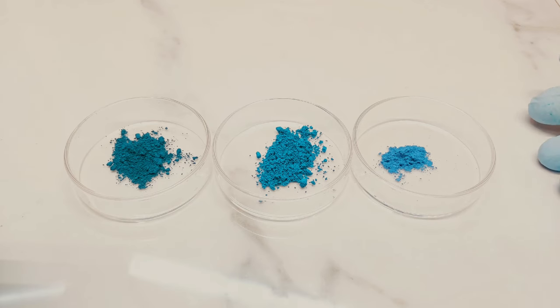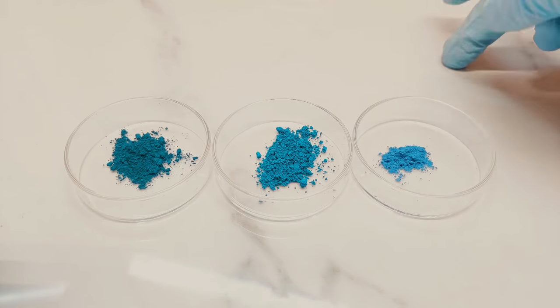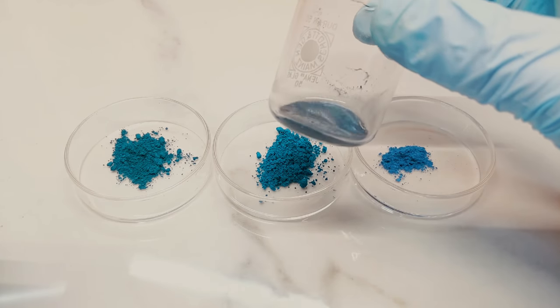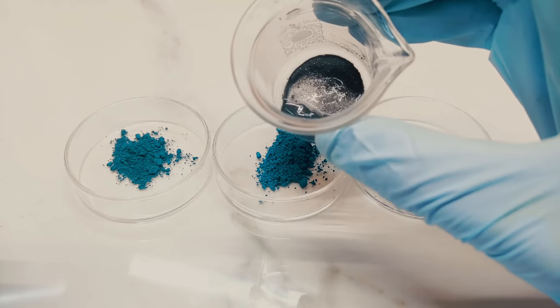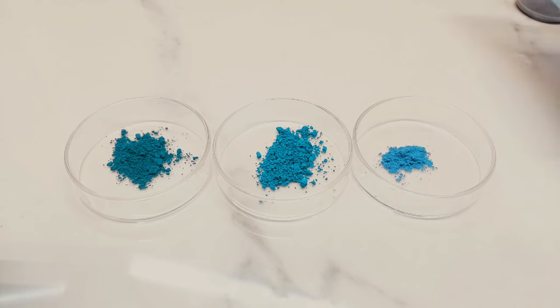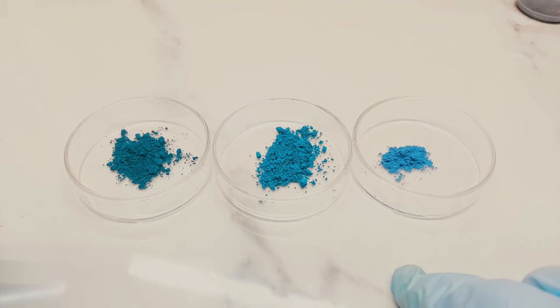Here we are with the three samples after calcining through the forge. I say three samples because, as I predicted, the tin oxide cerulean blue attempt basically stayed the same — it was as stubborn as I said it would be, and I'll have to write that off as a fail. With the remaining three samples, I was actually exceedingly happy with the results — all three of them worked out, each in different ways.